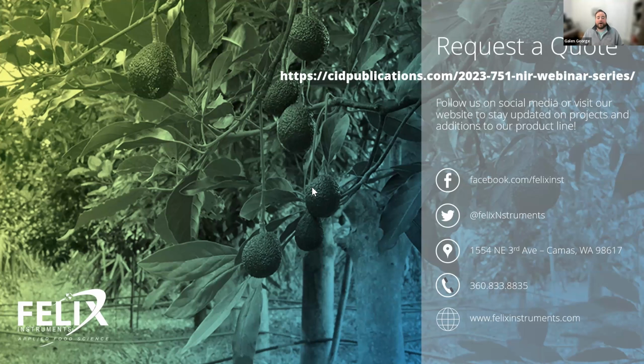So it's not about data quantity as much as it is about representation. It's making sure you are representing all the variables that are present within your data set. So regionality, seasonality, temperature, variety of commodity, all those things need to be evenly represented within your data set in order for it to be a well-predicting, robust model. And it's not so much about quantity, but if there are that many variables present, there's going to be more data than less in general. So that's really the best I can do to respond to that question.